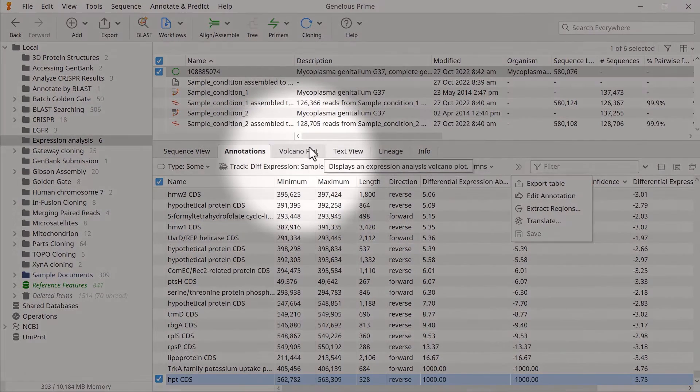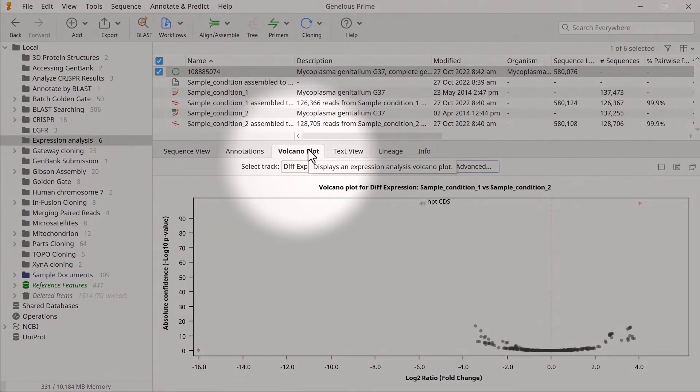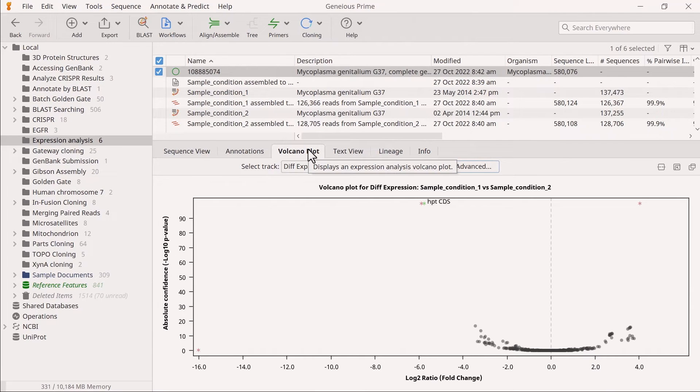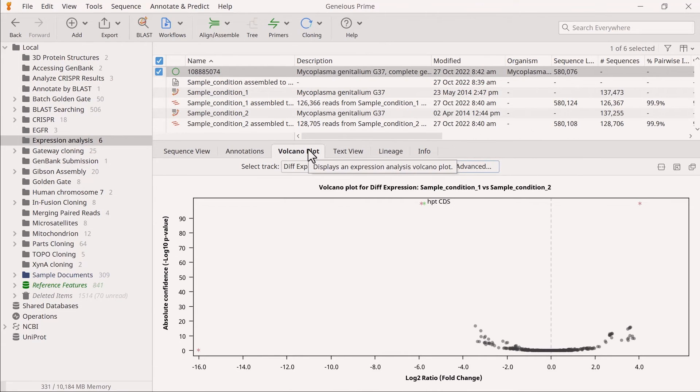By switching to the next tab, you can view the volcano plot. This scatter plot displays the gene fold changes on the x-axis and the absolute confidence levels on the y-axis.